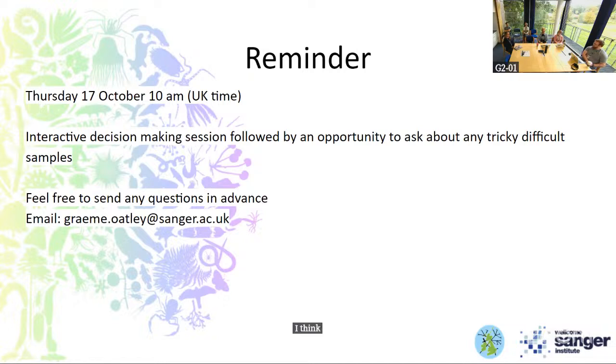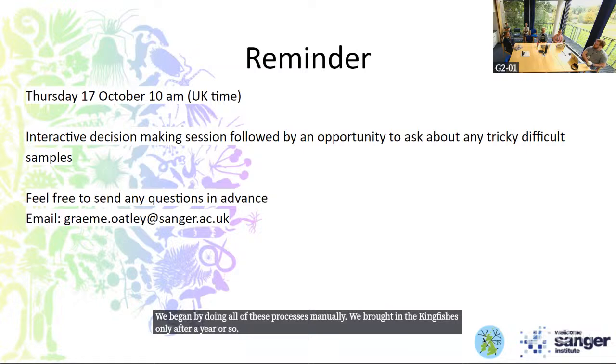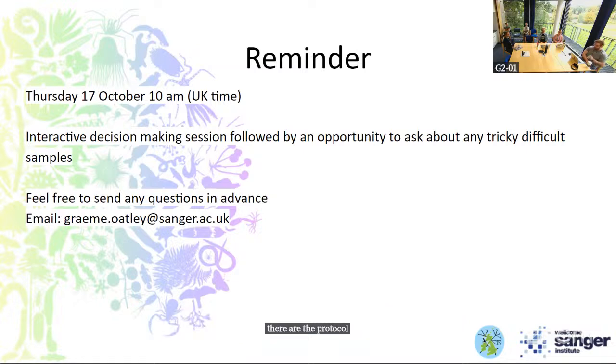It's also fair to say that we began by doing all of these processes manually. We brought in the Kingfishers only after a year or so. So the protocols are available. It is doable. It just is a different scale.